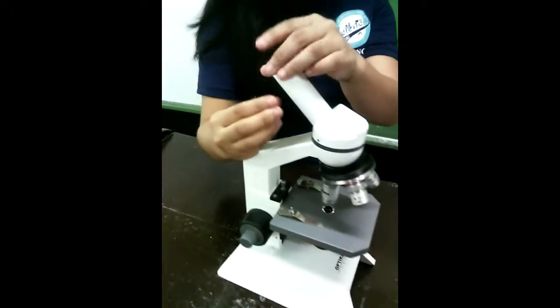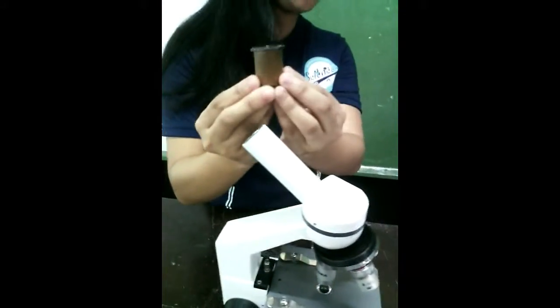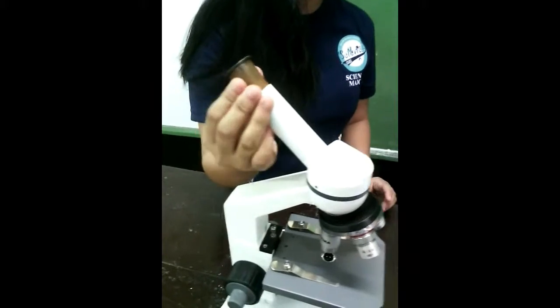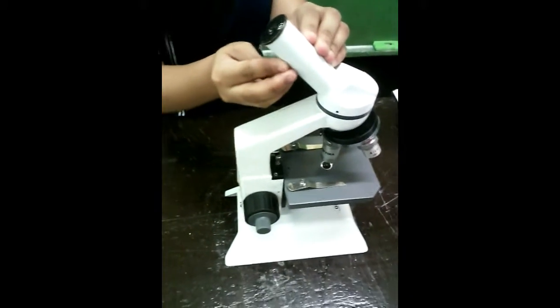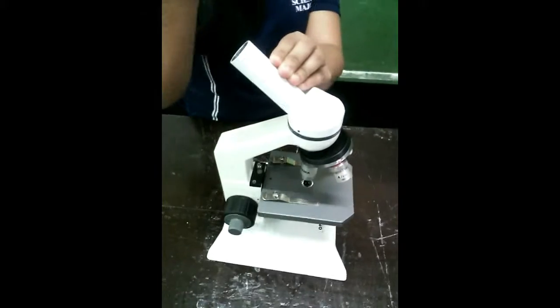This is the eyepiece or ocular. It is a detachable cylinder located at the upper end of the tube. It may have a line inside that serves as a pointer and rotates as the ocular is rotated.